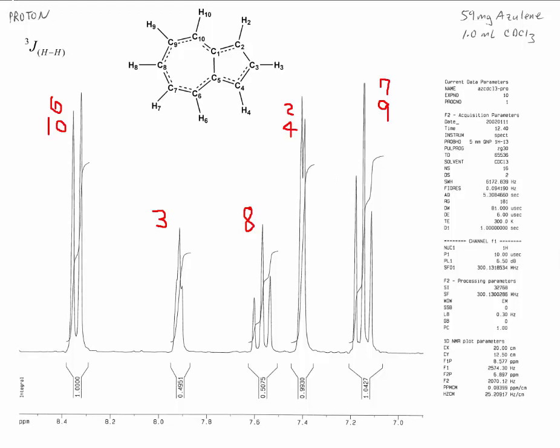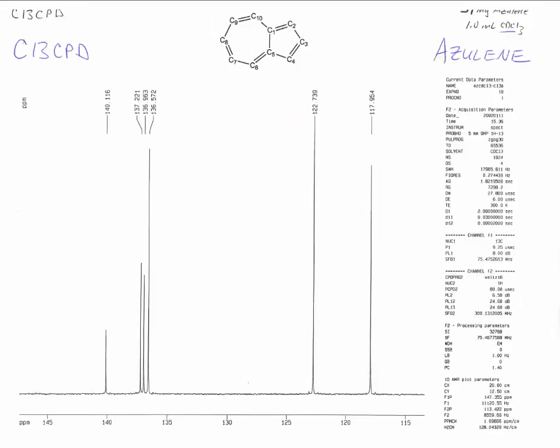We want to turn our attention now to the carbon spectrum of this very same molecule. And so here is the carbon-13 spectrum. It's called C13CPD. That's short for carbon-13 carbon-proton decoupled.